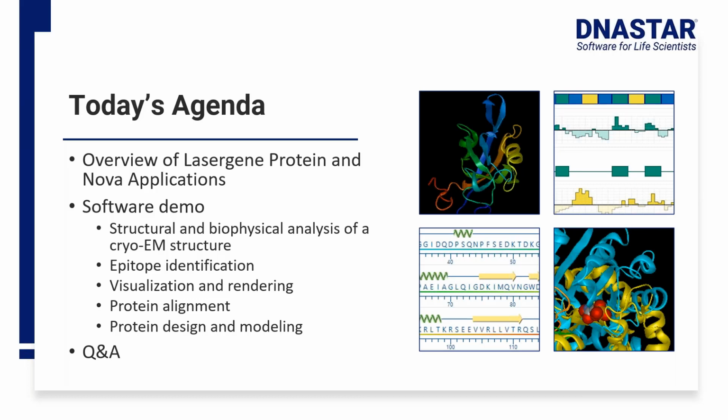We also have tools for protein alignment, as well as protein design and modeling. And I think we'll also be briefly showing some protein structure prediction with our NovaFold application. There's a lot to cover there. So again, if you want a little more in depth on protein modeling, I would say to schedule a follow-up webinar with Thomas after this. And then at the end, we'll do as much Q&A as we have time for.